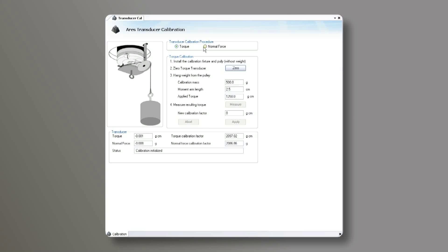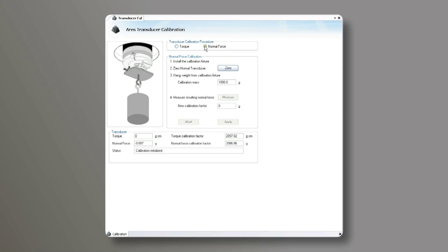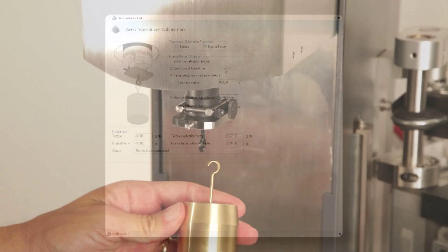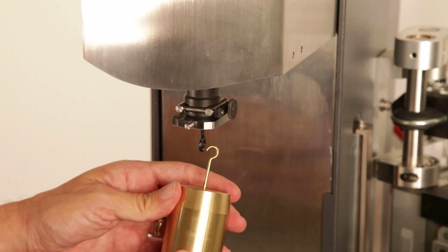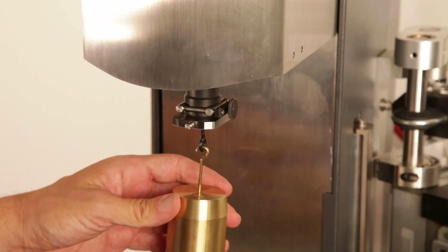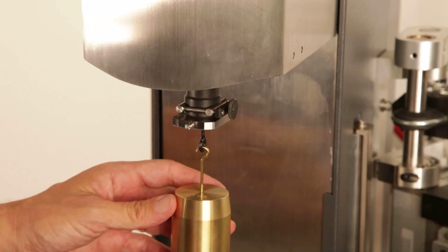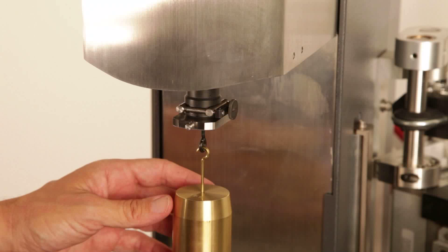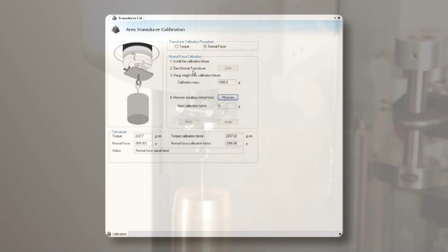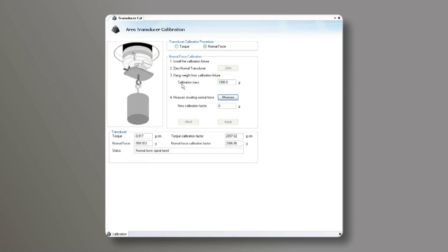To perform the normal force calibration, choose Normal Force in the calibration window. With the calibration fixture still on the transducer shaft, choose Zero and wait for the Zero step to complete. Hang the 1000 gram weight directly on the calibration fixture. Settle the weight to minimize any swinging. Next, choose Measure from the calibration window.